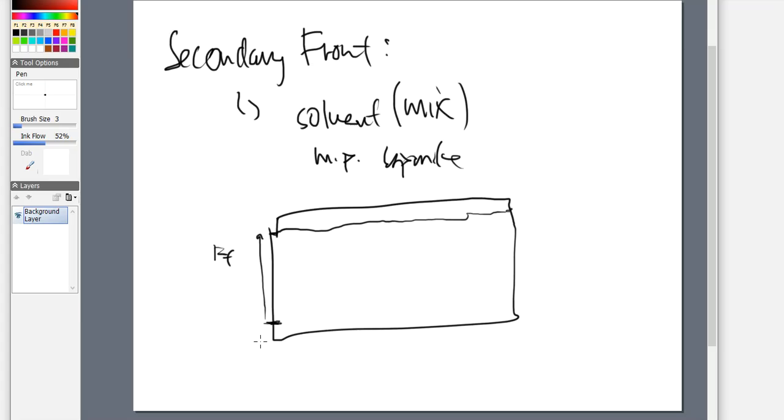Okay, well, there is a funny thing that can happen here. When I develop these plates in this particular type of TLC or HPTLC situation, there is a chance that as my mobile phase is getting sucked up, one component of my mobile phase is going to start separating and running a little bit faster than the second one. So if you develop a plate and in the imaging you see a secondary line, so primary is the highest, and this is where really the mobile phase went. But if I see a secondary line, then that means there was a component of my mobile phase that traveled way slower than another component in the mobile phase.